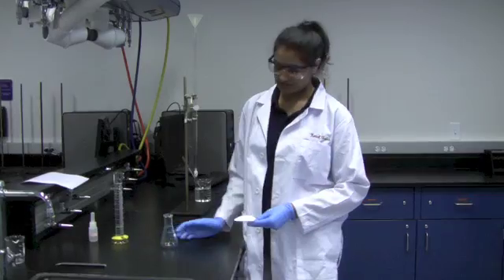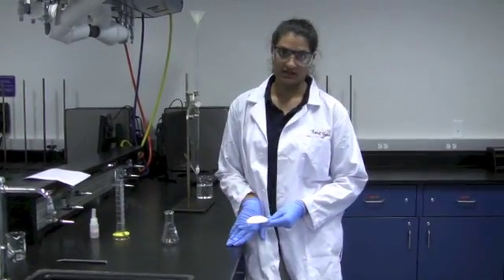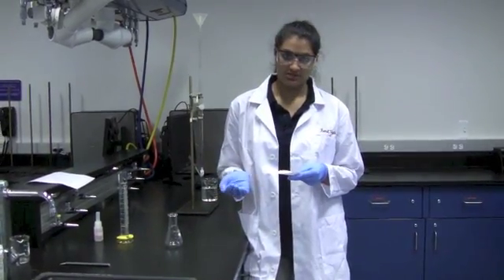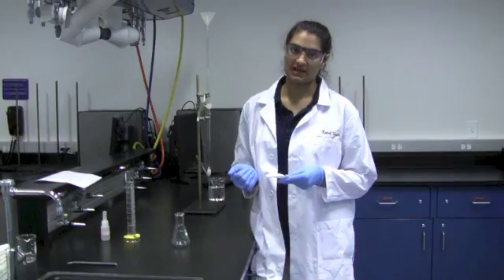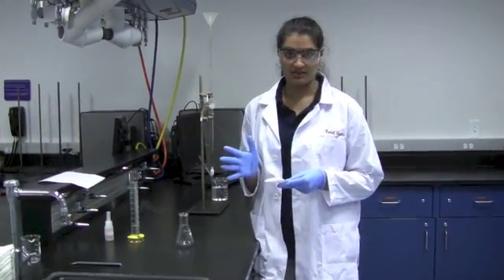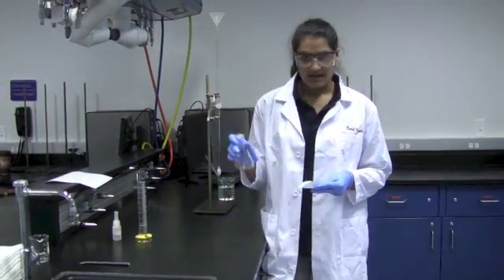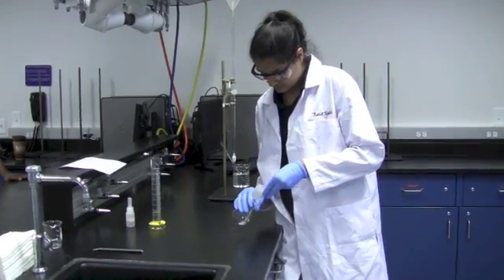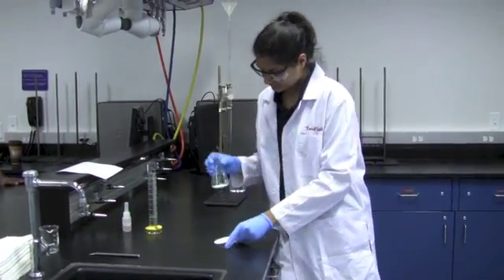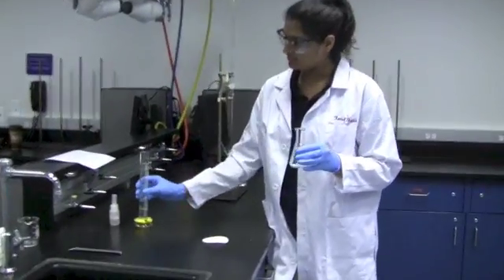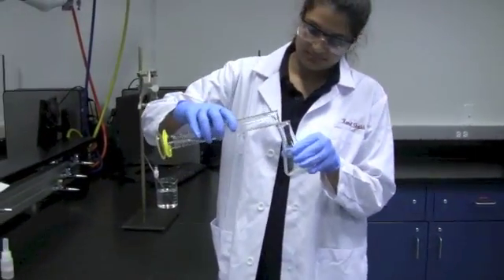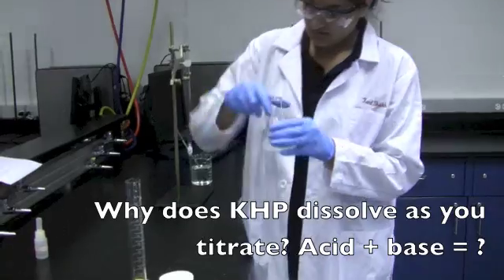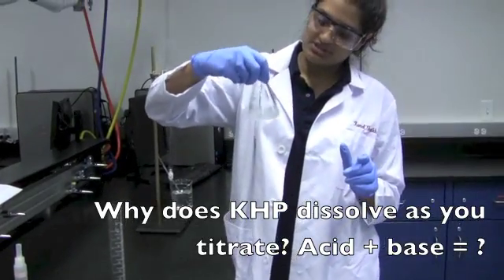Your next step is going to be to prepare the KHP solution. When you do this, you already calculated the amount of KHP that you will need before coming to class. So, weigh this on the balance and record it to four decimal places, and then add it to your Erlenmeyer flask. Once you do this, you're going to add 25 milliliters of water, and try dissolving the solution as much as you can.